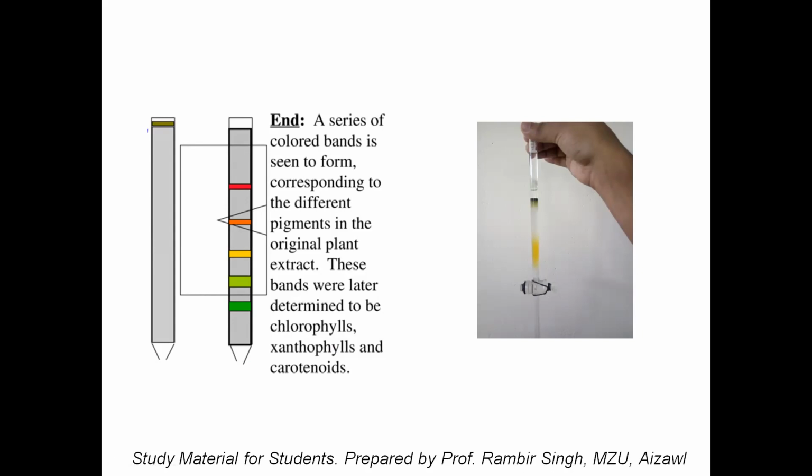When a compound interacts with light, it absorbs light at certain wavelengths. The wavelength of radiation which is maximally absorbed by the compound is called lambda max.